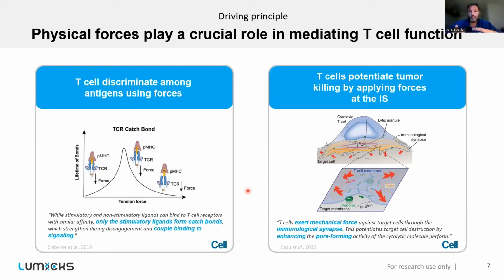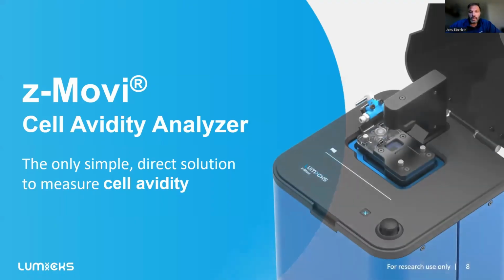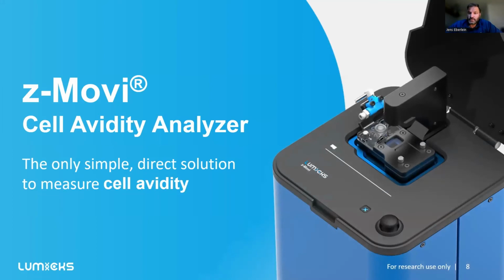There's a better perforin integration, which then leads to a higher deposit of granzyme B, and therefore better killing. We encounter forces all over the place in immunology. Up until now, we really did not have a good way of measuring these cell-cell interactions and looking at overall avidity. And this is where Lumicks as a company comes into play.